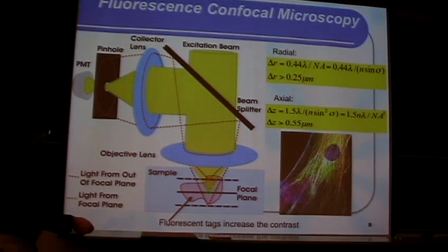So using this technique in biology and also in material science, one can learn about chemical composition and structural properties of different composite materials or biological systems which have very different types of molecules and different soft materials systems with different components.